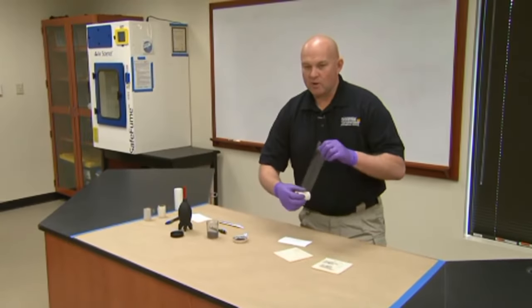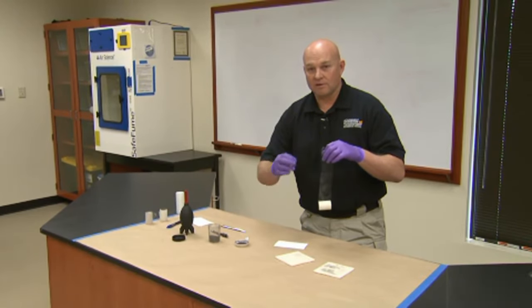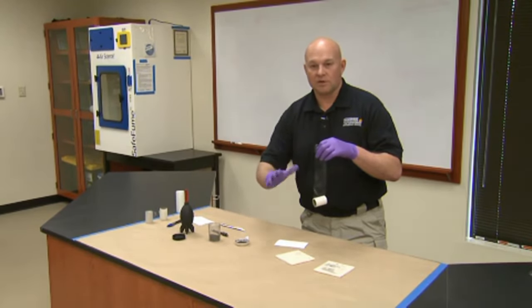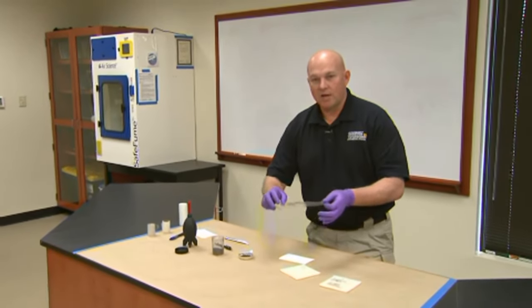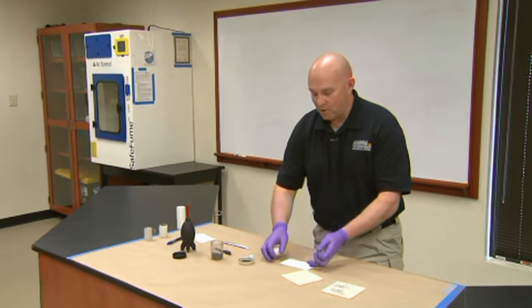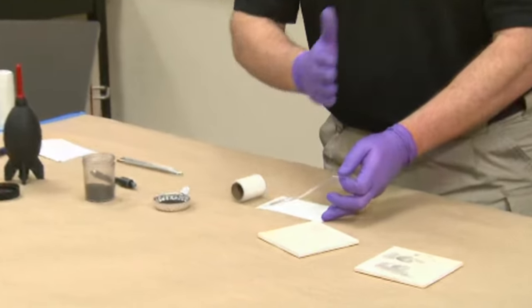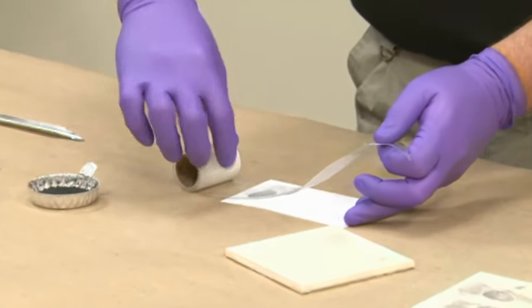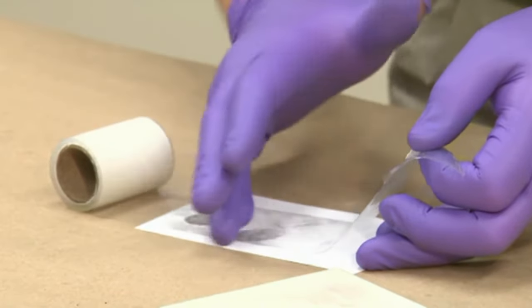Then apply it to your card. Sometimes whenever people apply it to the card, they will write their initials before applying it so that their initials are below the tape, just to show where it came from and who lifted it. Other people will go ahead and put it down and put their initials on the tape and on the paper. When you apply it, make sure you don't get any air bubbles — put it down on the edge of the surface and just work your way through.